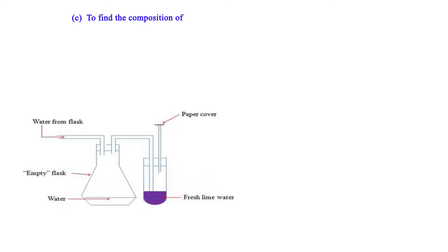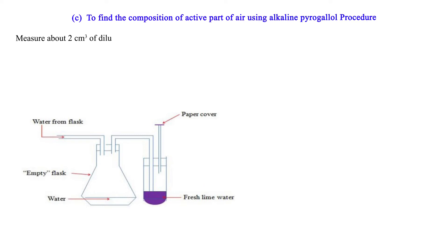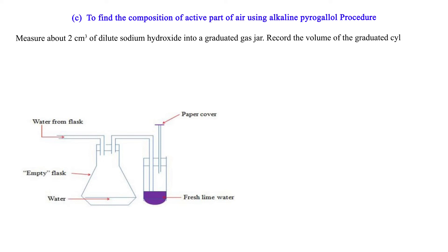To find the composition of the active part of air using the alkaline pyrogallol procedure. Measure about 2 cm³ of dilute sodium hydroxide into a graduated gas jar. Record the volume of the graduated cylinder, V1.